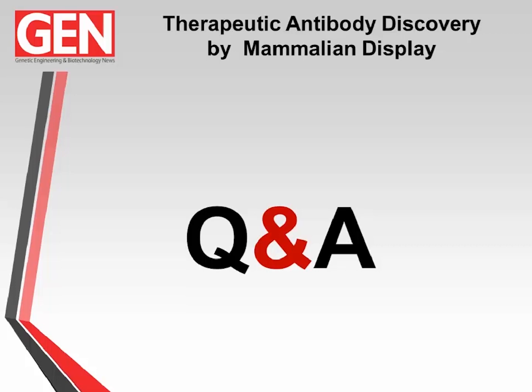So, actually, I think that same person asked another question. Sorry, I don't mean to take over the moderator's job here, but I see it's the same person who asked the question about percentage stable integration. Do you mean post-selection, i.e. 95 to 99% of the cells that grow through selection do not express antibody? No, absolutely not that.